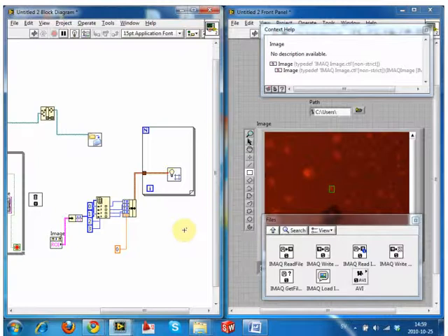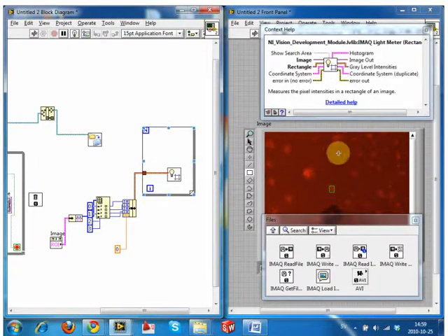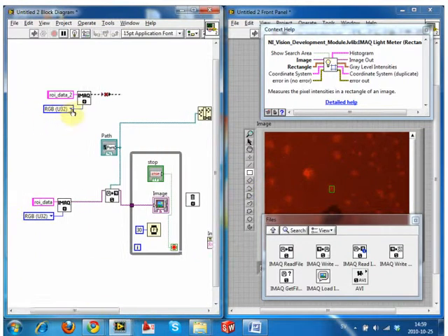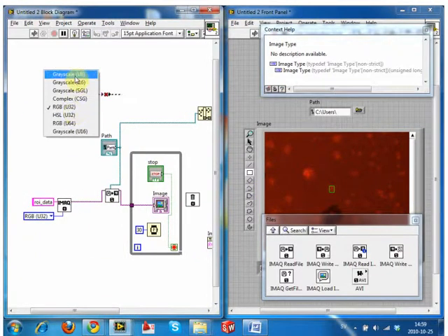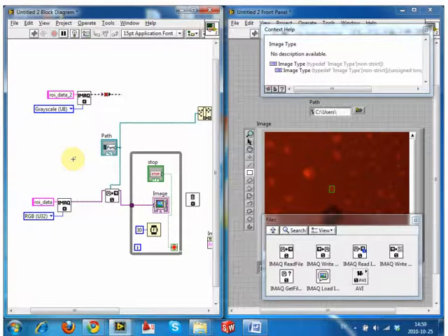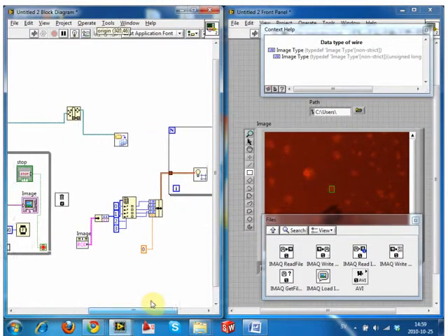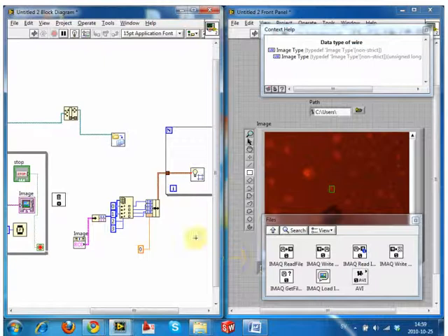The quickest way to make a color image a gray image is to change the memory allocation. Now if we read a color image into this space in the memory, it will make it a grayscale image. It will use all channels.